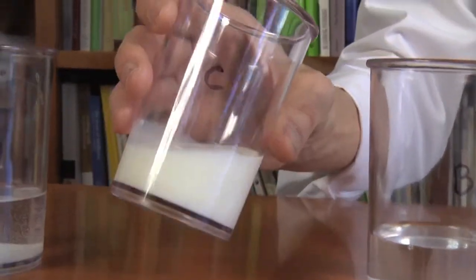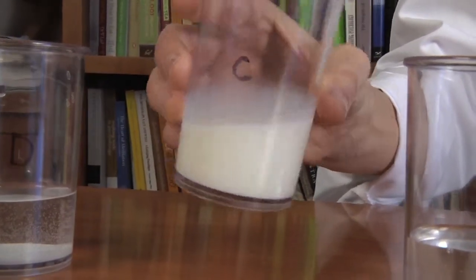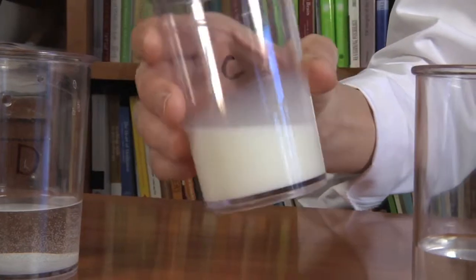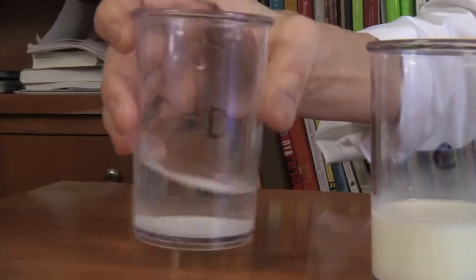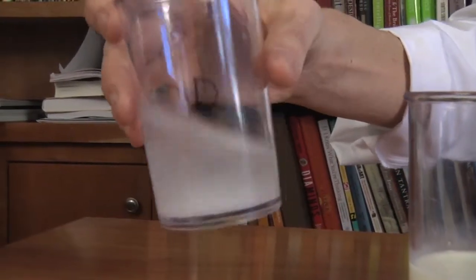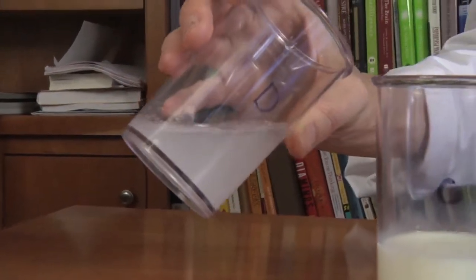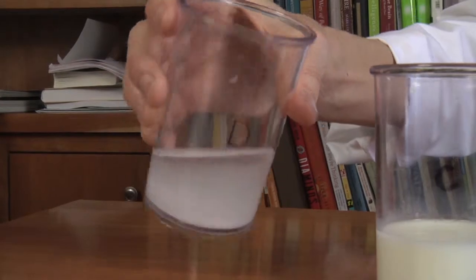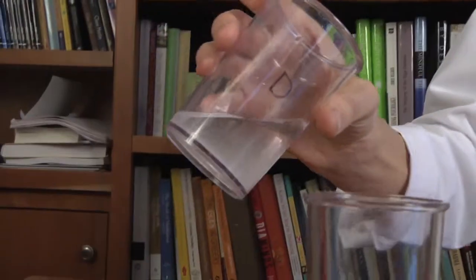Let's take a look at C. C is much thicker and it's not clear — it's a cloudy, milky, white color. And it has almost no smell. D is kind of thin and has some material in the bottom, some white stuff at the bottom. It's thin like water and has kind of a weird smell, a little salty smell.